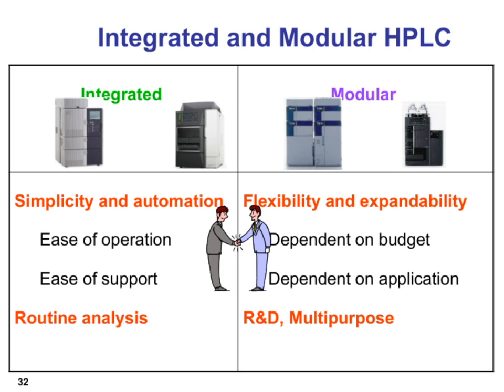On the other hand, modular systems offer greater flexibility and expandability. They allow you to customize and adapt the setup based on your specific needs, which is particularly useful in R&D or multi-purpose environments. However, they're more dependent on the application, requiring careful planning as your needs evolve.